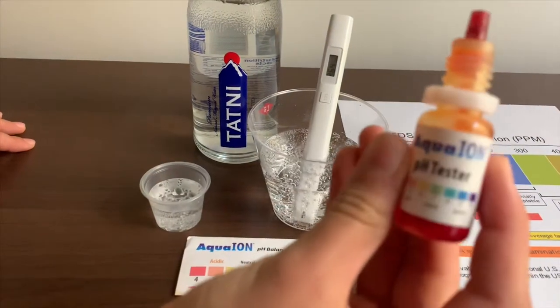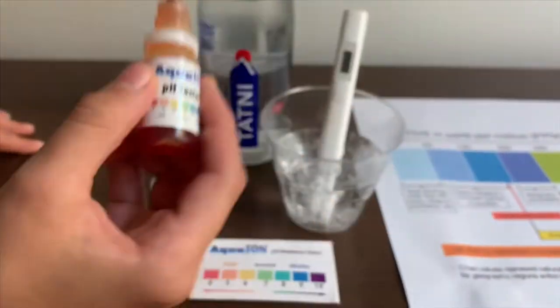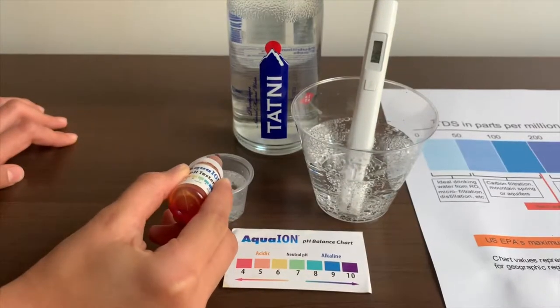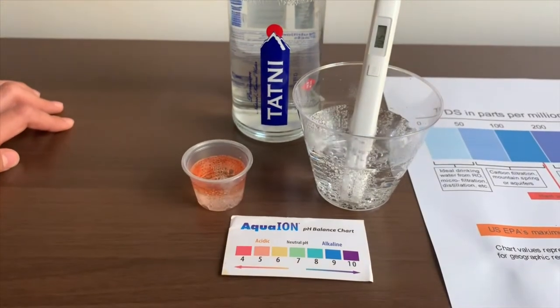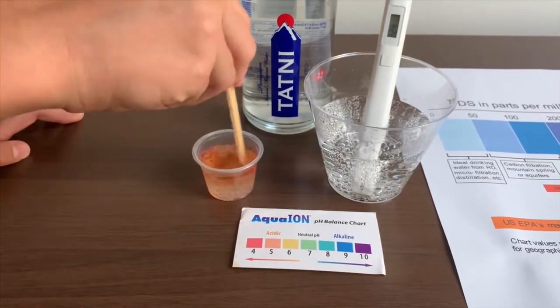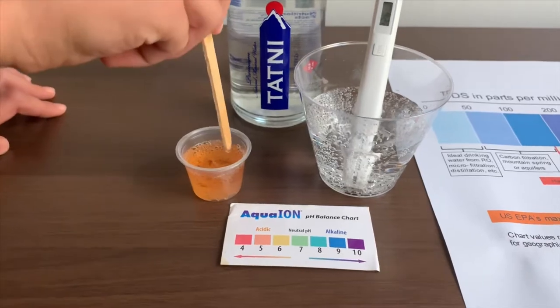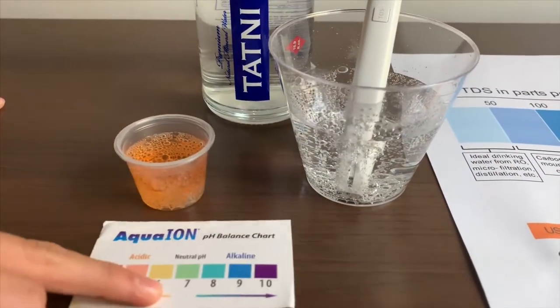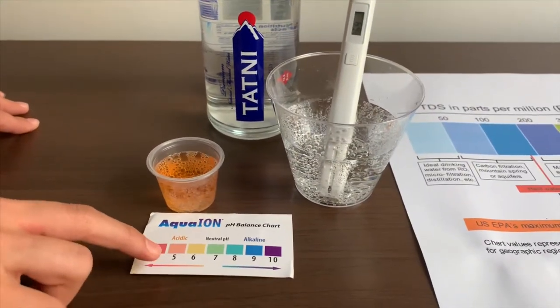Let's test the pH level next. The link is also down below. Two drops only. Let's turn the pH so we can see the pH level better. I'd say that is a 5.5 — that is acidic.